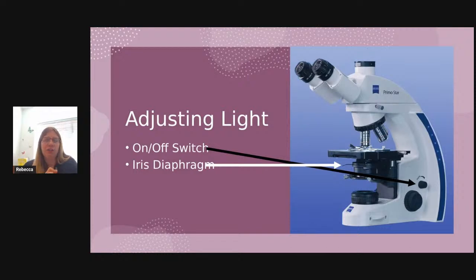So I always like to start with that all the way closed, which would be all the way to your right hand side. And then as I'm looking through the microscope, just give that slight taps to tick it towards open bit by bit until I'm seeing that grid.